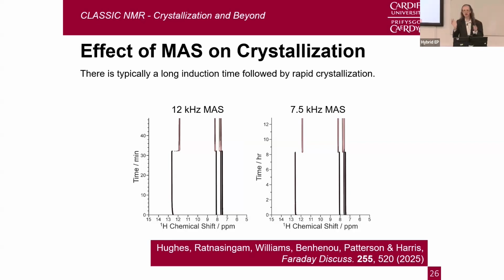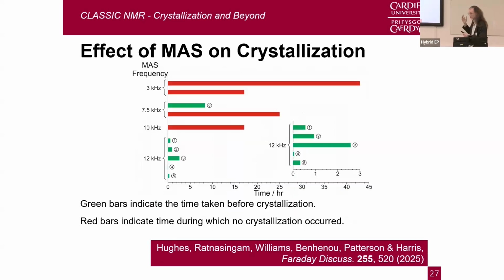Now, obviously, this is just 2 experiments. It's the identical sample, just cycling the temperature and changing the spinning speed. And we are allowing for the different effects of the heating from the spinning on the temperature, so we've taken that into account. These are identical temperatures inside the rotor. But that's just 2 experiments. It's a stochastic process, so we can't read too much into just 2 experiments.